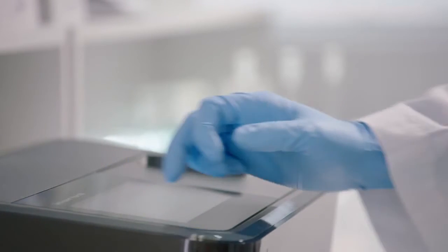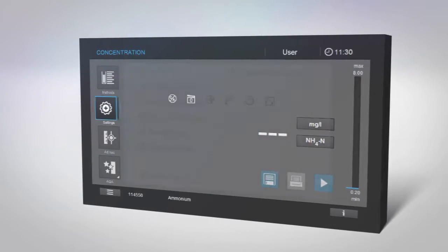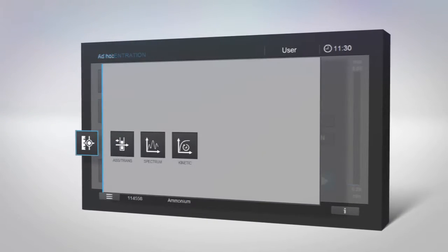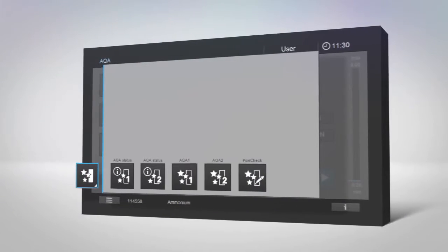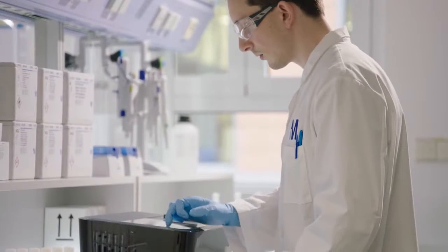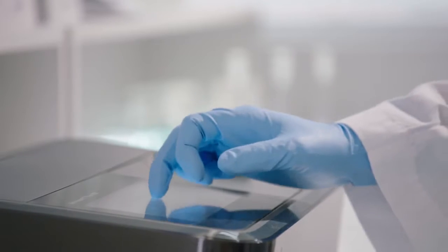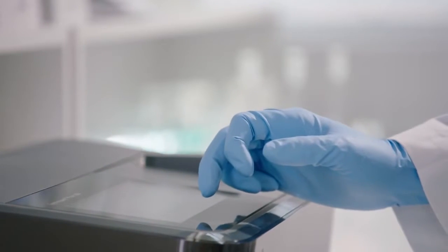SpectraQuant Prove's intuitive smart screen makes navigating through the software as easy as possible. Simply tap on an icon in the menu to select your desired function. The touch screen isn't just easier, but also smarter. It integrates even more details, so you have all the information you need in a single, clear overview.